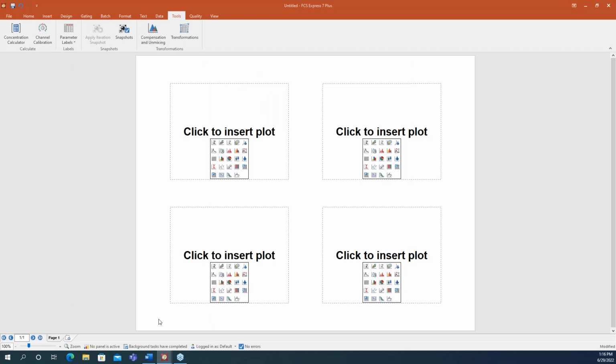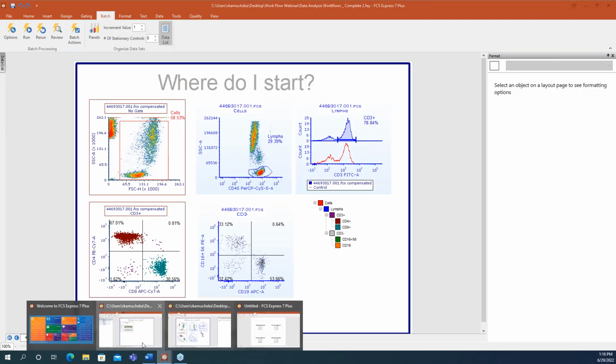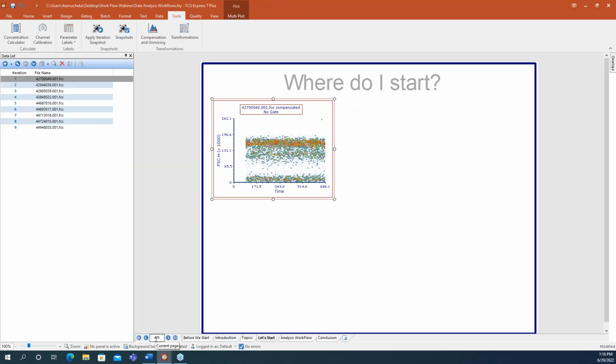Now, I won't go into much more detail about compensation, but if you do have any additional questions, you can see some of our webinars and videos that are available on our website. And of course, our support team is always a great resource to help you with those compensation things. Now back to our analysis strategy. So this first plot was created with a default setting, but we can always format colors, fonts, fills, borders, titles, and so much more.